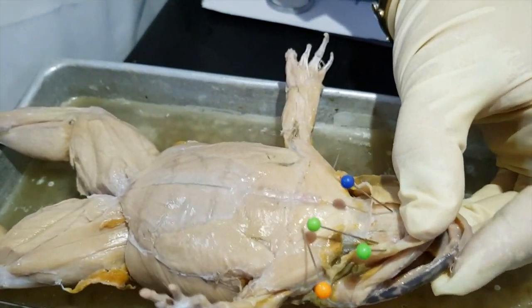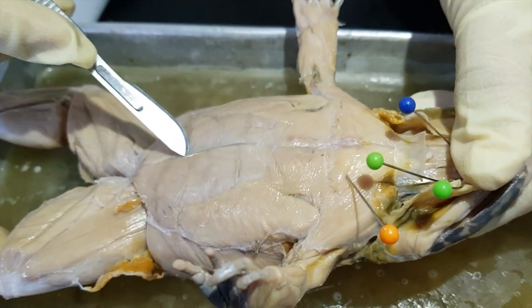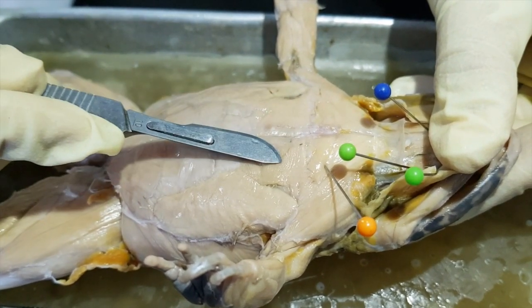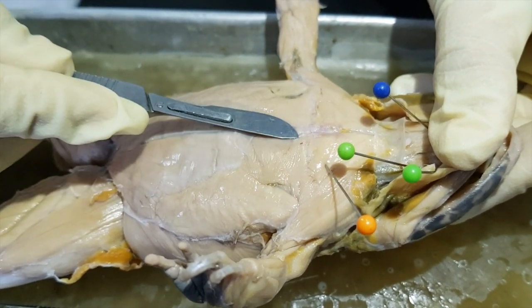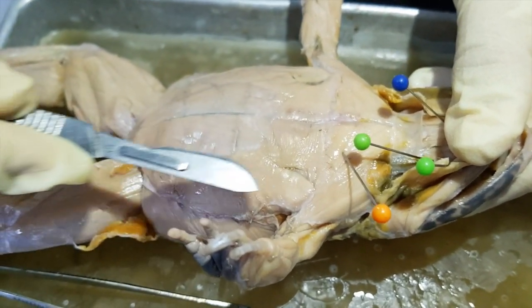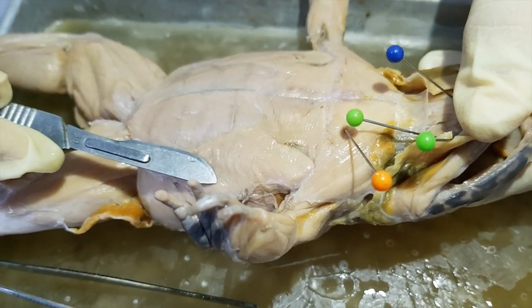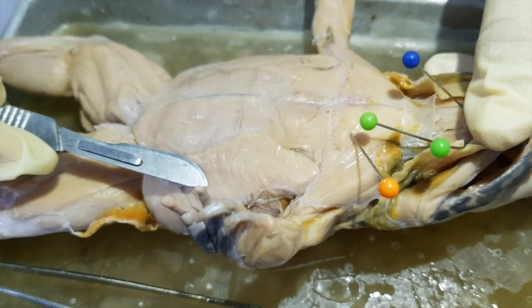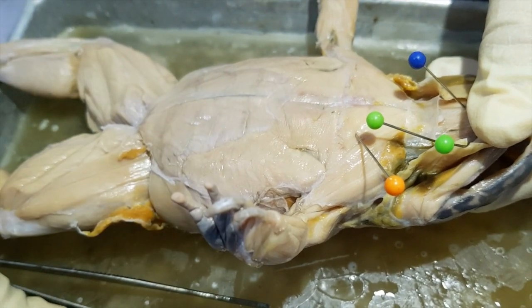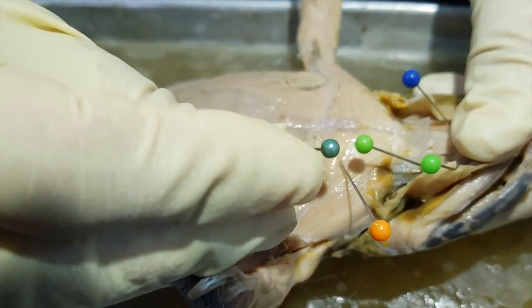Okay, next are the pectoralis muscles. The pectoralis muscle runs downward. Okay. So this one here is the anterior pectoralis, but in the manual it says cutaneous pectoralis. These are the major pectoralis group, the pectoralis major, but for some it is identified as middle and posterior pectoralis. So there's anterior, middle, and posterior pectoralis, but we'll use the terminology cutaneous pectoralis and pectoralis major.